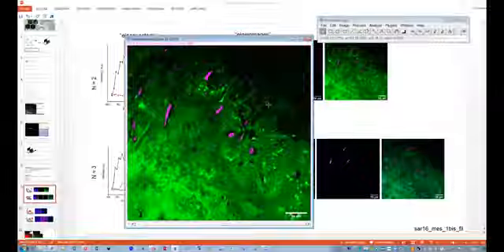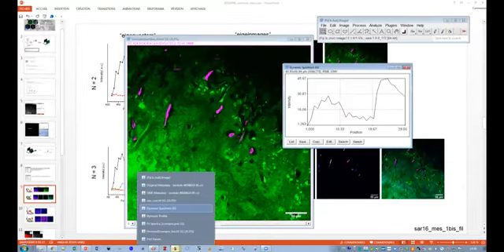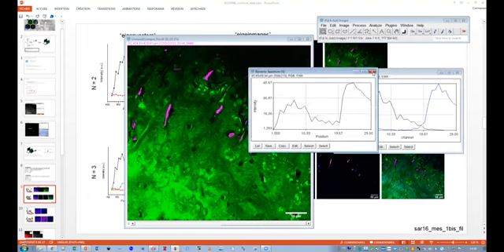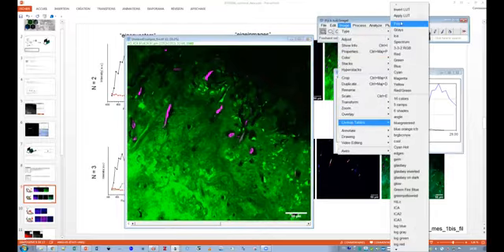Yeah. So here you have the first eigenvector. And if I put the first channel.